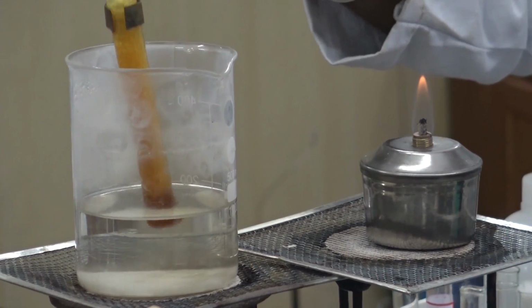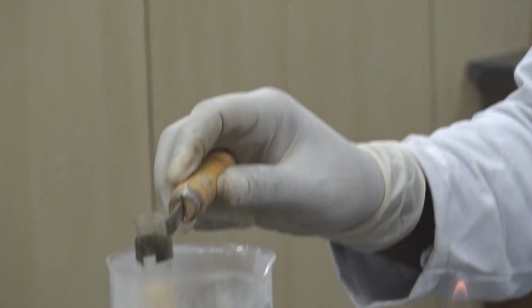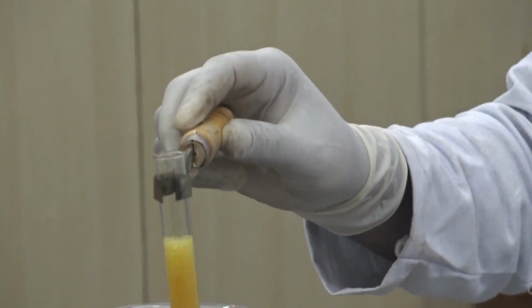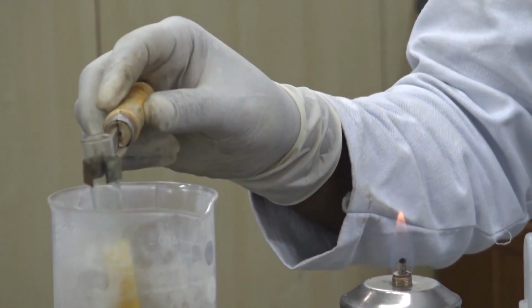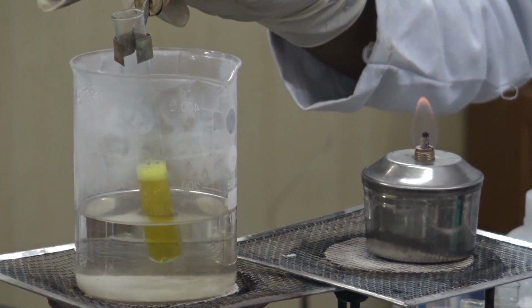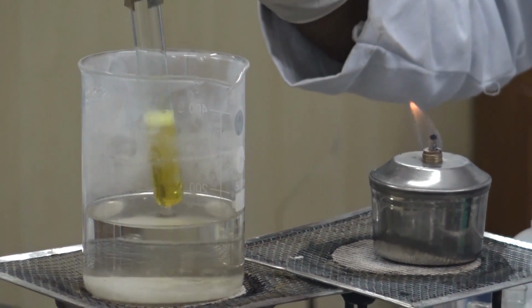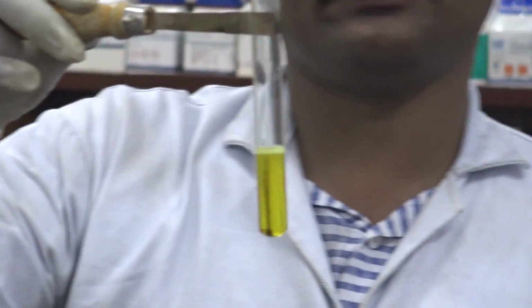During this heating, the chromium plus 3 is oxidized to chromate ion, which will be tested using lead acetate solution. After heating, the reaction color changes to yellow, which means the oxidation has completed.